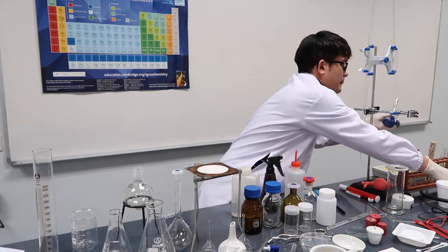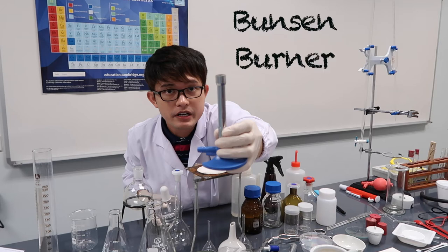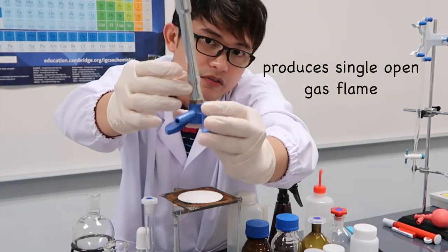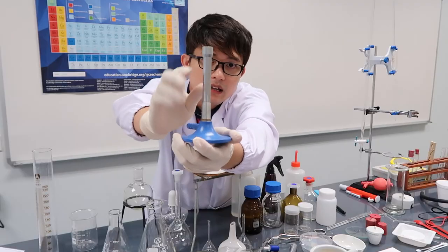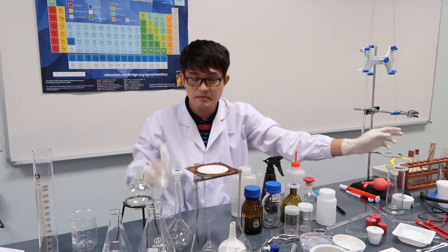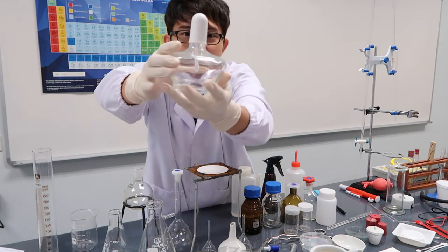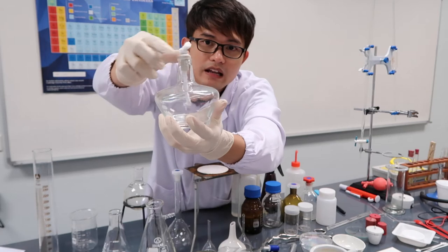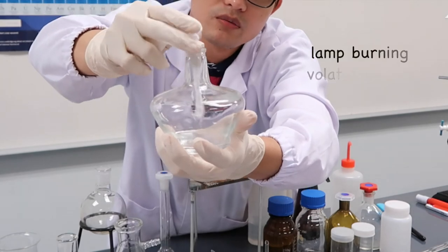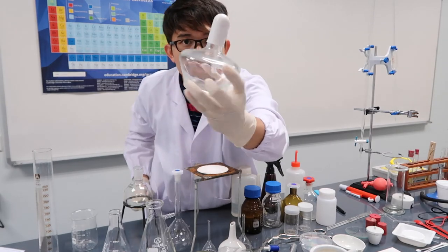Here is the Bunsen burner. It's connected to the gas supply to control the flame. If you don't have a Bunsen burner, you can use a spirit lamp — also called an alcohol lamp. You just fill it with alcohol like ethanol or butanol, and that's the alcohol lamp.